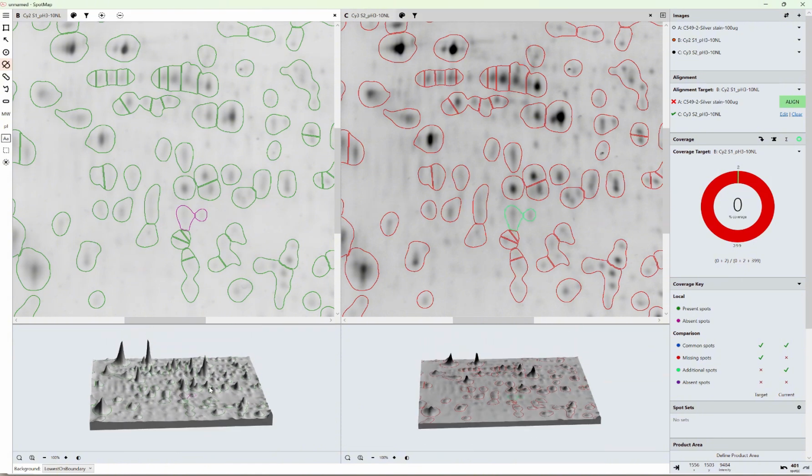So the false color overlays basically allow you to change the color of your image, and they are different to your brightness contrast score, which you can set per image within SpotMap. So if you were using two different sets of images from two different scanners with very different contrast ranges that you need to adjust to get them in line for you to visualize them, we do support doing that separately for each image.